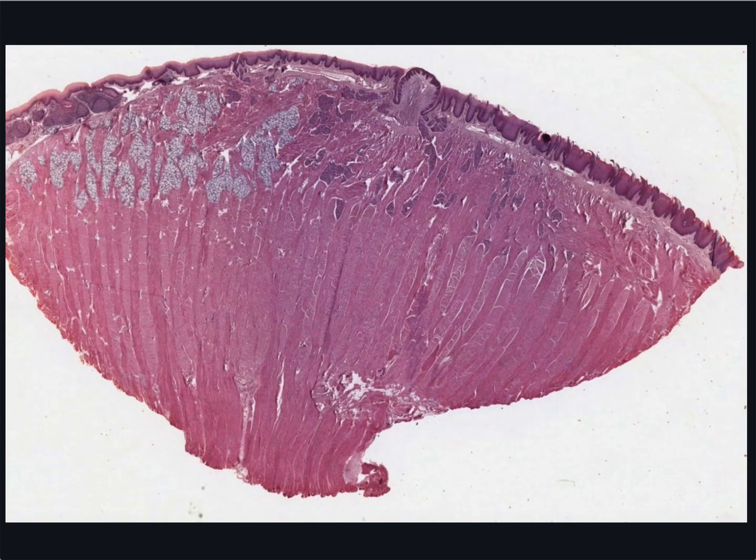This is a longitudinal section through a tongue at the junction between the anterior and the posterior portions. Anterior is over here to the right. One landmark for the transition is this large circumvallate papilla. It's one of 3 histological features that enable me to distinguish the anterior and posterior portions of the tongue.